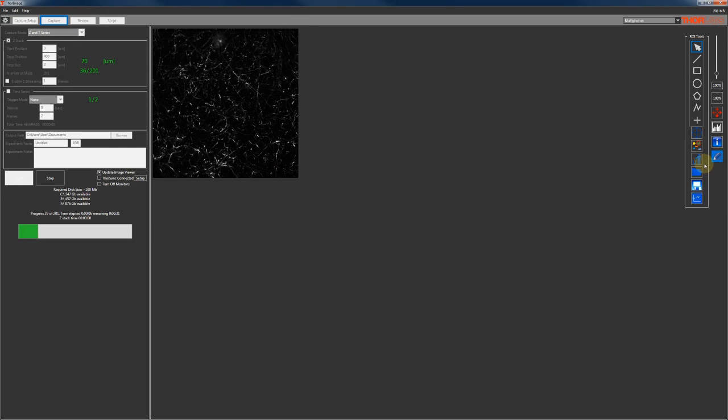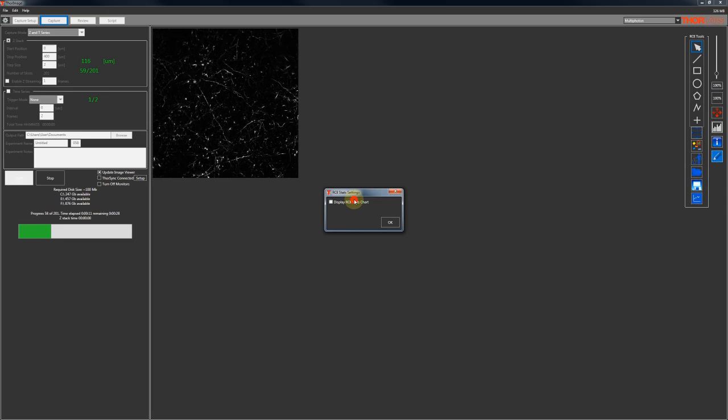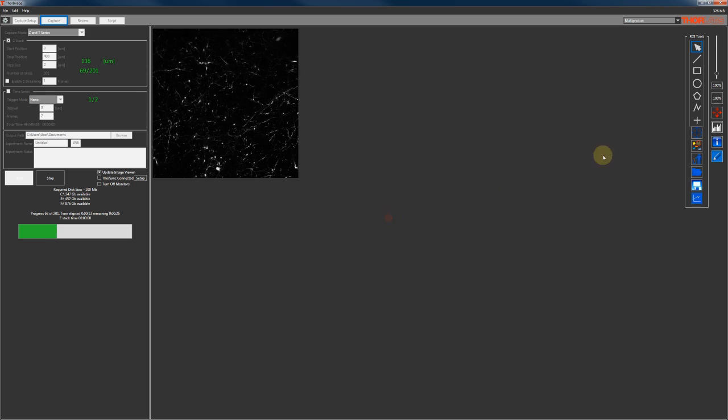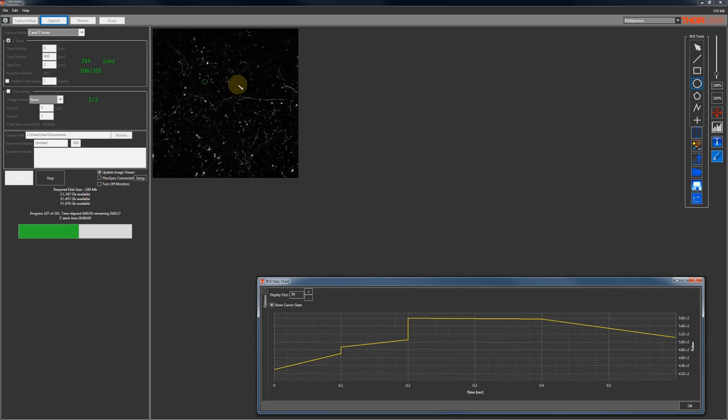We can also perform real-time ROI analysis as it acquires the image set. Let's pick an oval shape and set 4 regions of interest to analyze the average image intensity in each ROI as a function of Z.